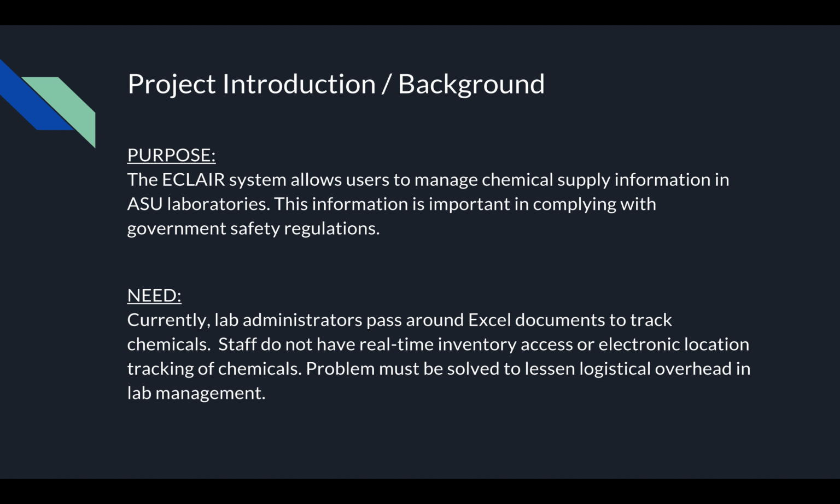The purpose of this project is to allow users to manage chemical supply information with ASU laboratories. There is a need for this project as currently lab administrators are passing around Excel documents to track chemicals. We will solve the problem and lessen the logistical overhead in lab management.